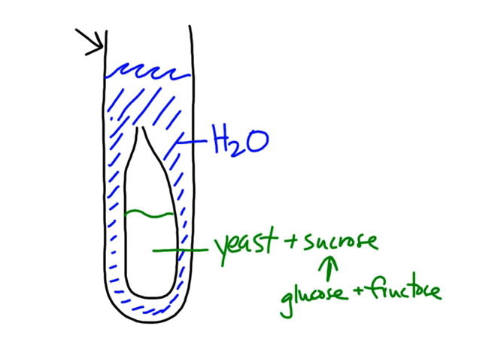And then when you put the tube back in, this yeast and sucrose will be exposed to those different temperature waters, and you are going to look at three different temperatures. You're going to look at a warm temperature, a room temperature, and a cool temperature.